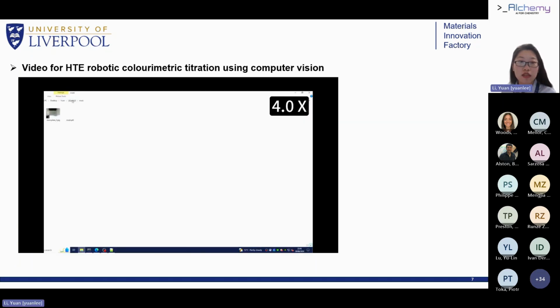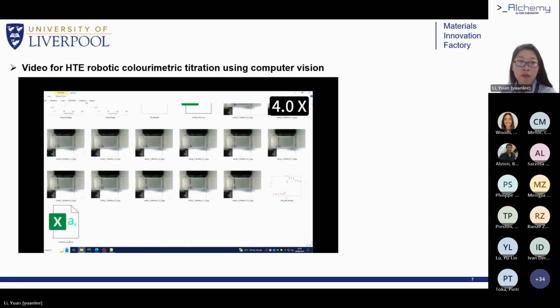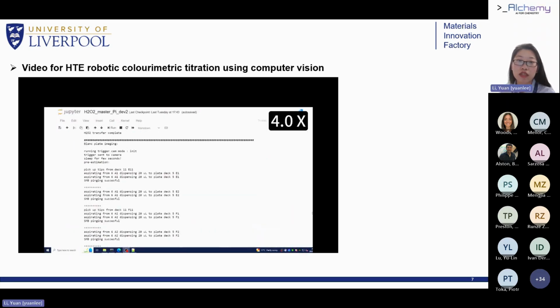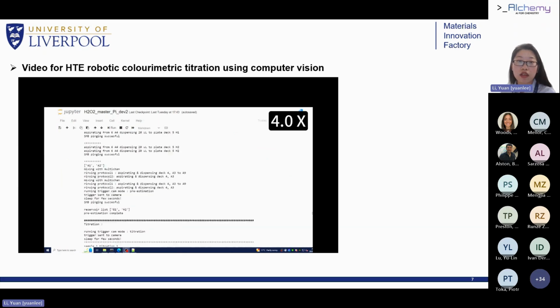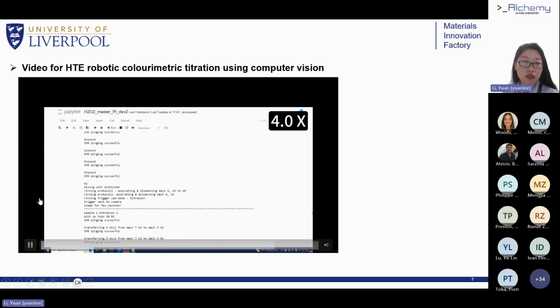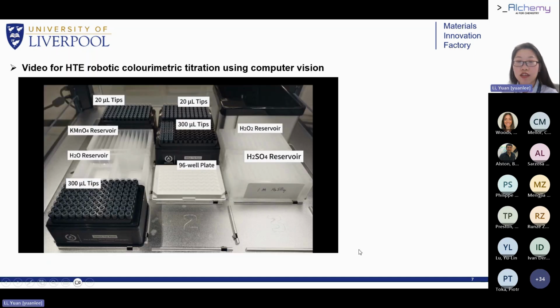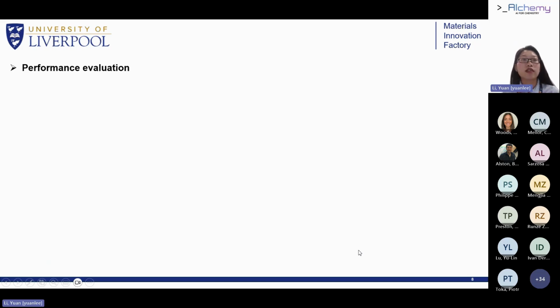And then this is the document storage for each batch of the run. The code records help the chemist to know what happened during the titration workstations. And it is also important once we develop an analysis workstation to evaluate its performance.